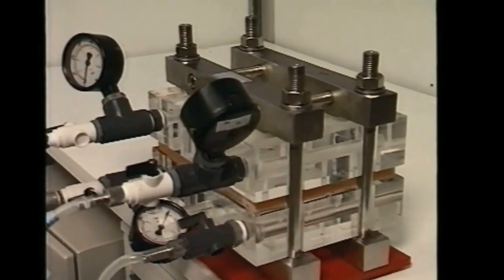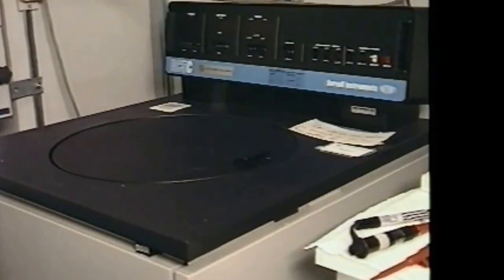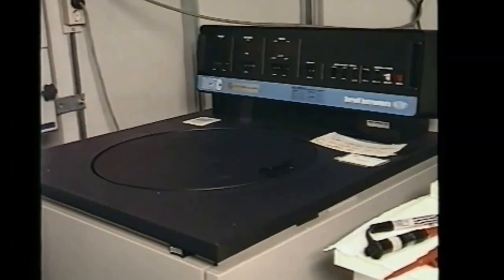Some systems have a short lifetime due to clogging, and some systems are totally unsuited to continuous flow applications and so are unusable in continuous processes.